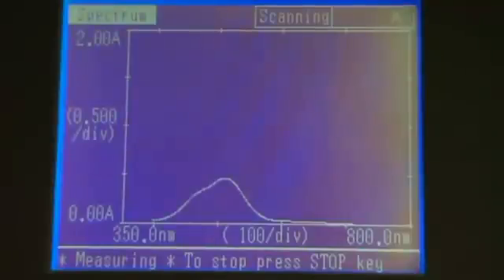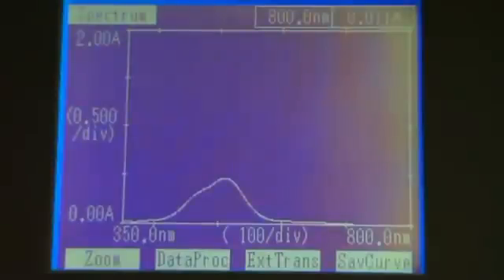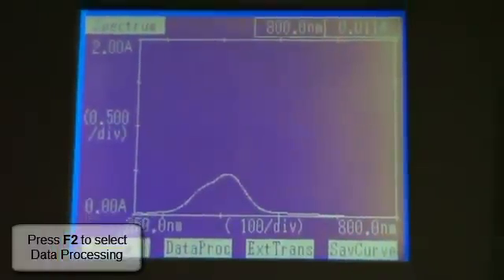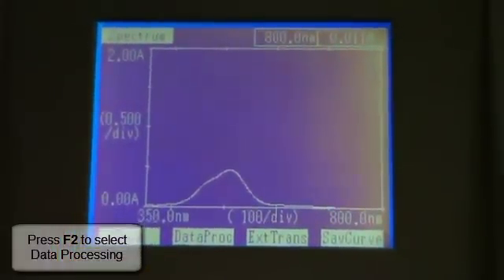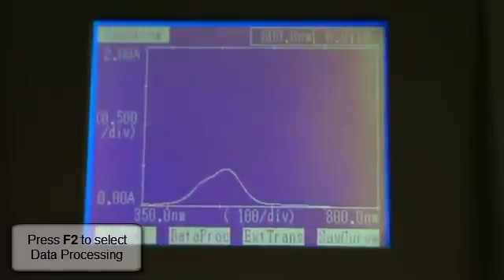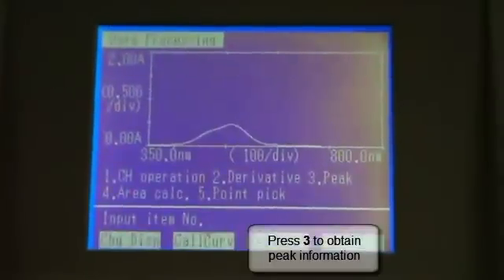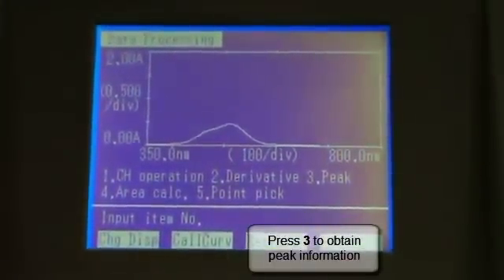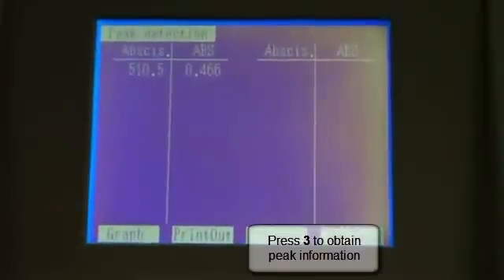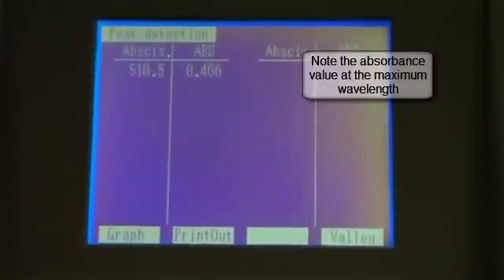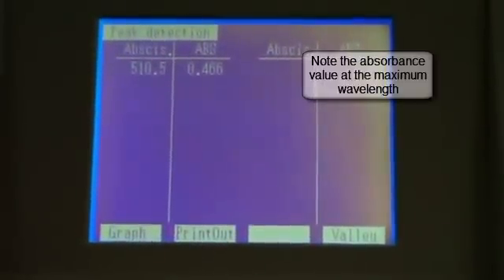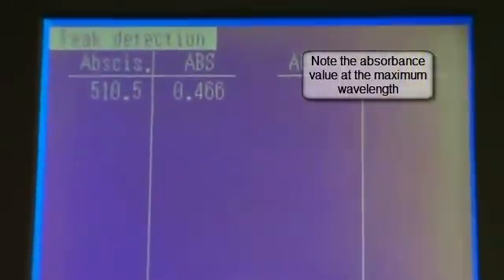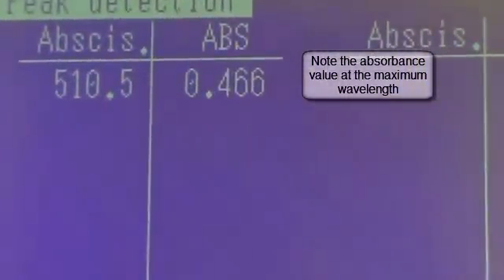And very often we want to get the value, the y-axis absorbance value of this peak. To obtain this we press F2 on the keypad to select data processing and then 3 to select peak. The instrument will list the wavelengths where the peak occurred, only one in this case, and give the absorbance at this value. You'll need to note these values down.